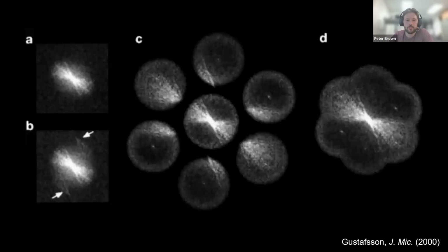Just to put this back in the context of some of the experimental data that we've already shown, we start with our raw SIM image, then we perform this band unmixing step. For a single angle, we're producing these 3 bands. For the second angle, these 3, and for the third, these 3. And then we perform the Wiener filter to combine these bands into our single super resolution image.